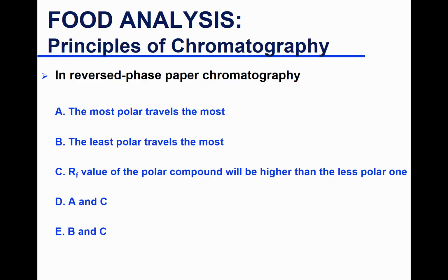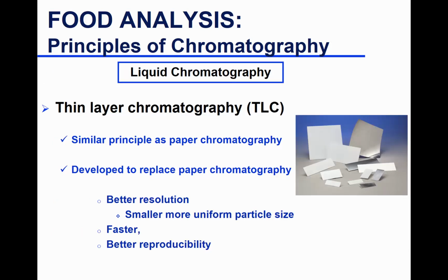All right. Moving on to thin layer chromatography, which is another planar chromatography. The planar chromatography is paper and thin layer chromatography, and then there's column chromatography that we'll move on and talk about later. Thin layer chromatography, or TLC.